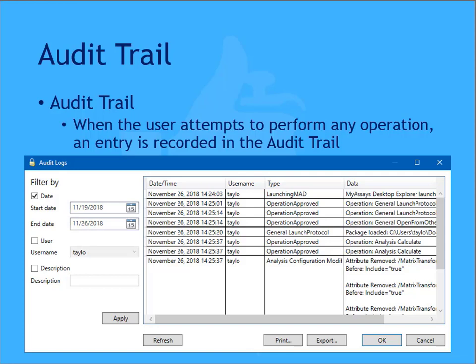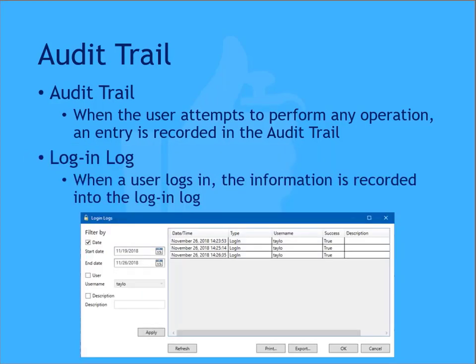The logs can be exported, printed, and searched. Also, the logs are securely protected at the operating system level against unwarranted modification. Similarly, each time a user logs into the system, it is recorded in the login log, again with a date and time stamp. You can also print and export the login log.